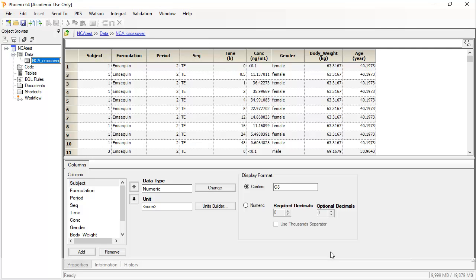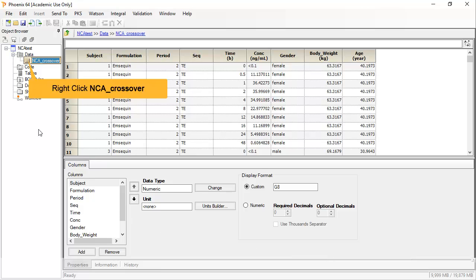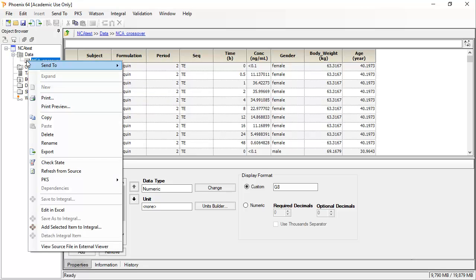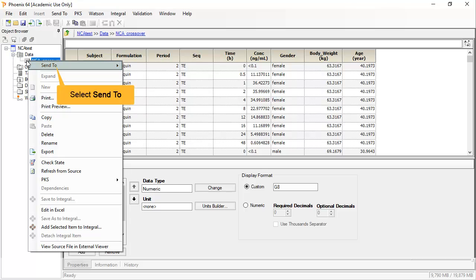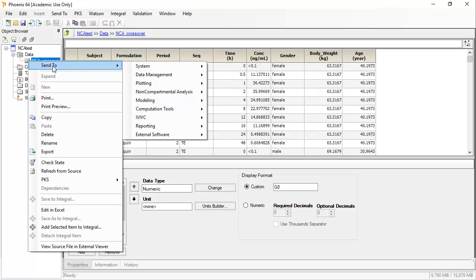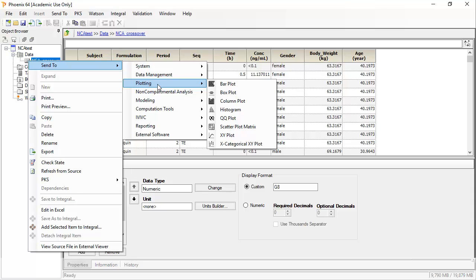In the object browser, one can right-click on any worksheet to see the actions that can be taken. Selecting the Send To option displays all the analysis objects that can be performed upon that dataset in Phoenix. For example, to generate a plot, let's choose Plotting, and then the XY Plot item.